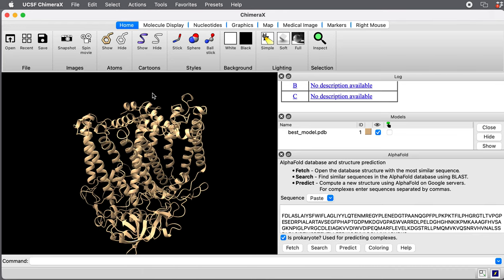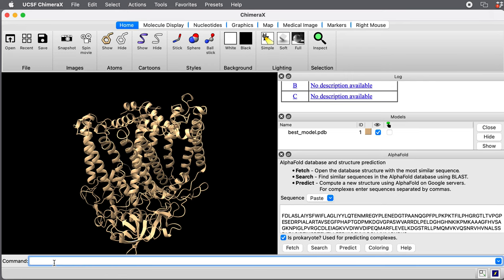When it opens automatically in Chimera X, it will color it according to the confidence. Each residue has a certain confidence score. Let me show you how to do this coloring now that we're loading it from the downloads folder. I use the color command, color B factor. The confidence scores are put in the B factor column of the PDB file. I put the model number one, and I'm going to say palette alphafold.